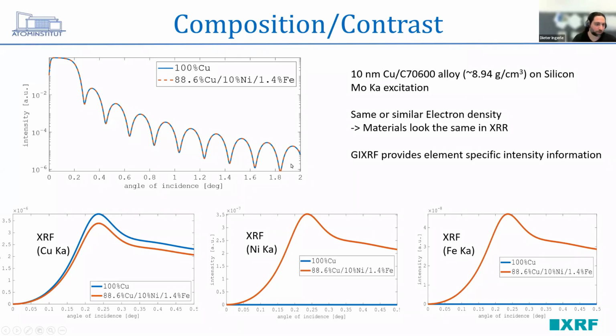But that's my reason to say: just also take the fluorescence signal, and you can see immediately if there's something else. For typical layers, maybe you know what you're depositing, but it can also happen, of course, that there's some unwanted contamination or whatever. In the fluorescence, we typically see it clearly, even if it's just in the percentage or even the ppm range. So this can be helpful to trace contaminations.